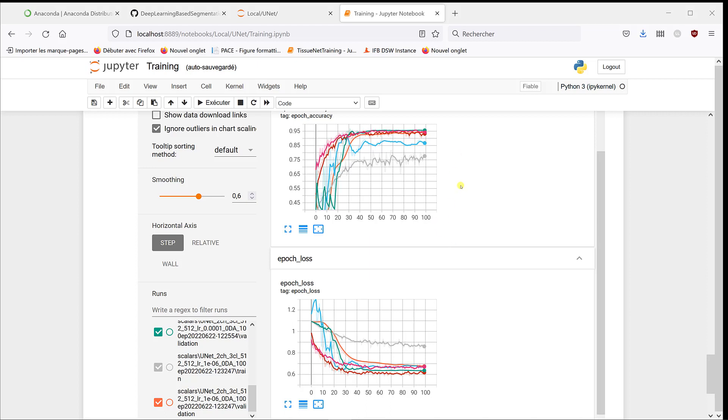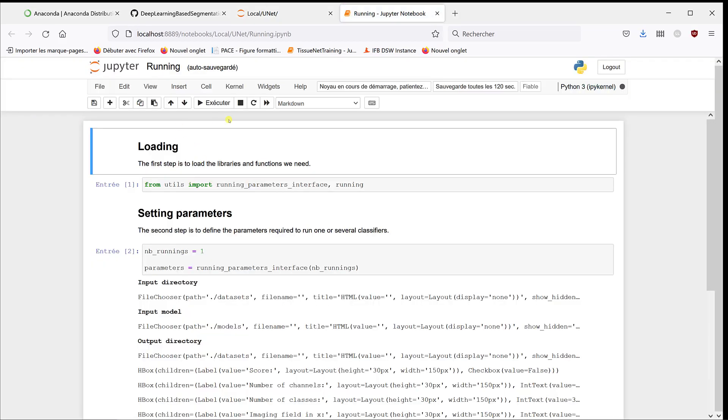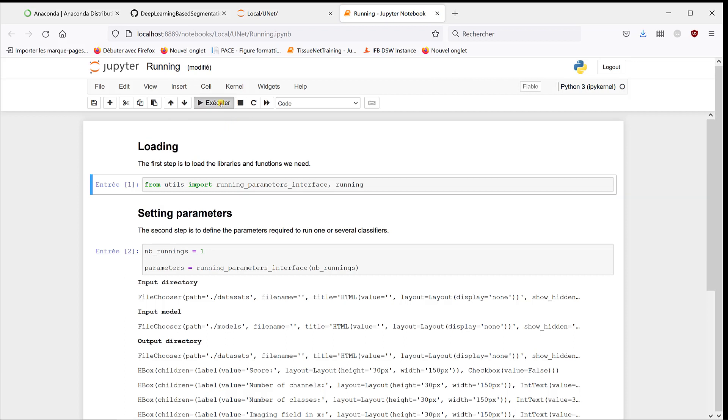But here we'll just use this model, so I can now close the training, shut it down, and use the running notebook to process the images.